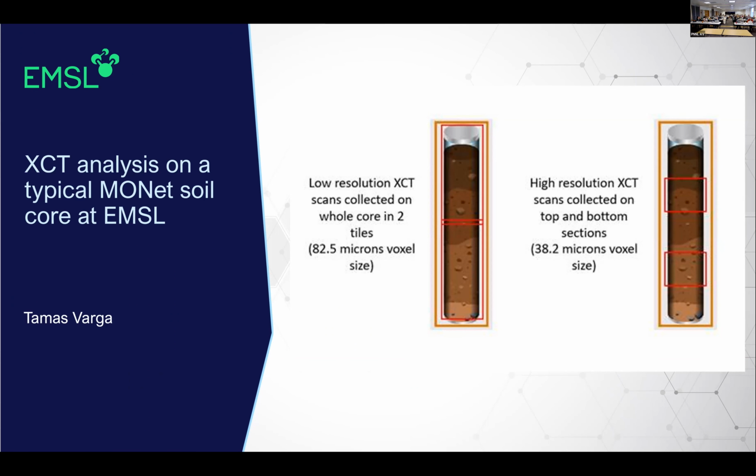Marcus was first. Oh, okay. Yeah, go ahead. So in your sample, you will have particulate organic matter, right? That you are not segmenting right now. So are you taking them with the pores or are you considering them as the solids? That's a great question. Sometimes we're not sure whether that pore is filled with water or organics.